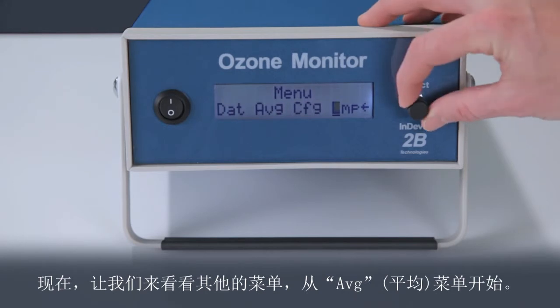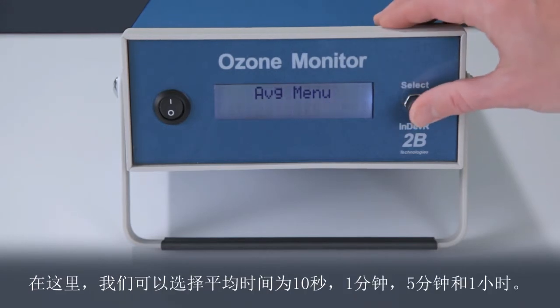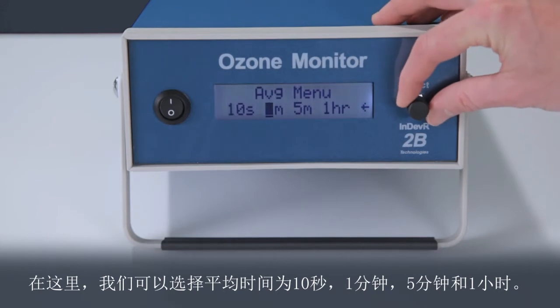Now let's explore the other menus, starting with the averaging menu. Here we can choose averaging times of 10 seconds, 1 minute, 5 minutes, and 1 hour.